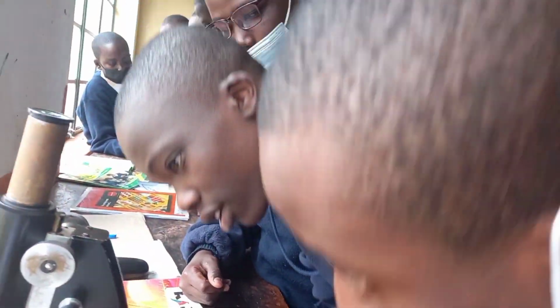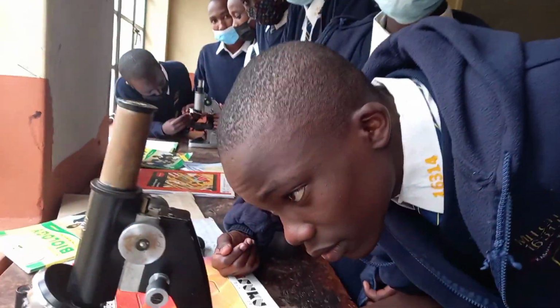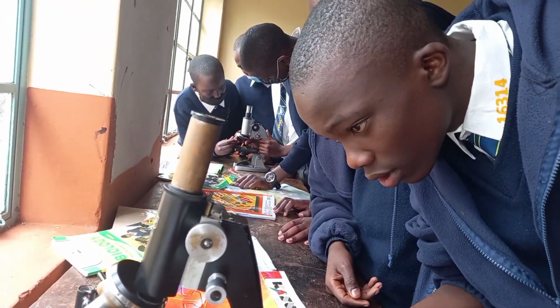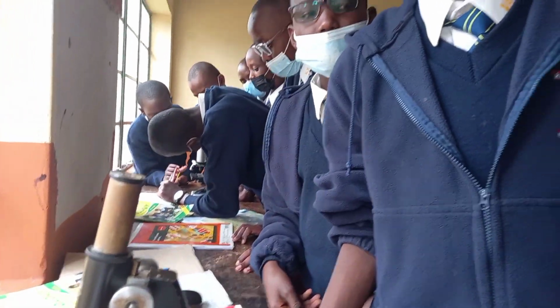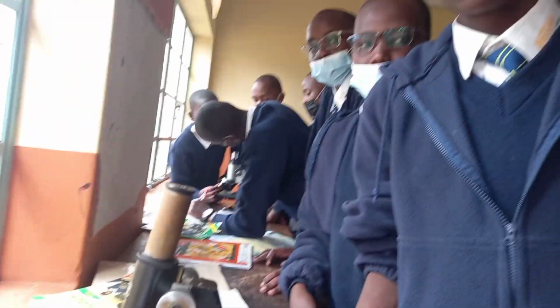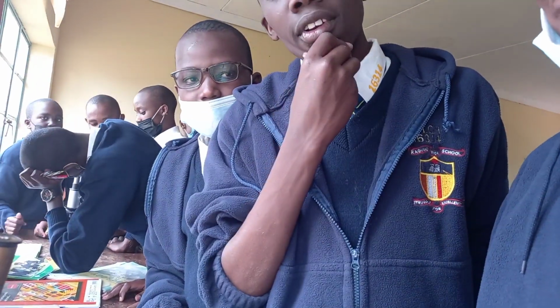It's written low power. Yes, it has the least magnification, times 5, and it is the shortest. Then what other objective lenses do we have? Apart from low power, we have the medium power and the high power.